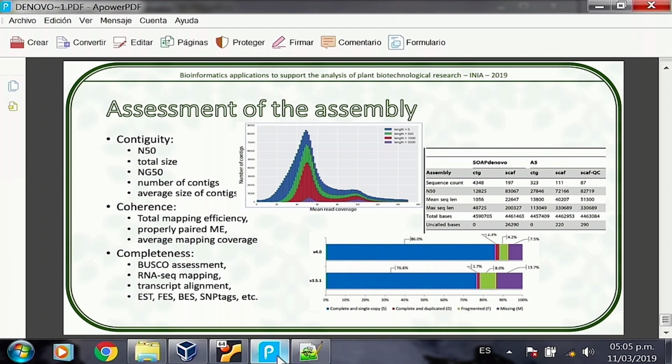But if you don't get any PCR results, the most likely reason is that region doesn't exist. It is an artifact of the assembly process. The algorithm, for some reason, misassembled this part, and it's just making this up. It happens. Trust me, it does happen more often than one wishes.